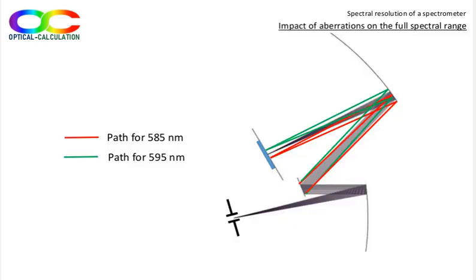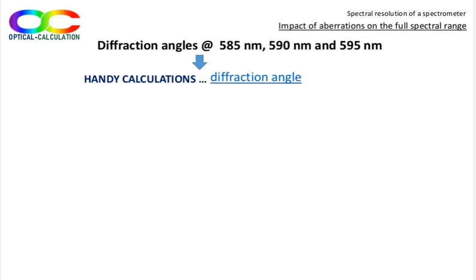We have also to evaluate the performance of the optical system across the spectrum. For that, we will evaluate the performance at the minimum and maximum wavelength of the range. Practically, we just have to rotate our fake flat mirror replacing the grating such that the change in reflection angle equals to the change in diffraction angle corresponding to the considered wavelength. Let's first calculate these changes in diffraction angle. For that, we come back to the handy calculation tool and use the calculation page diffraction angle for reflective grating.